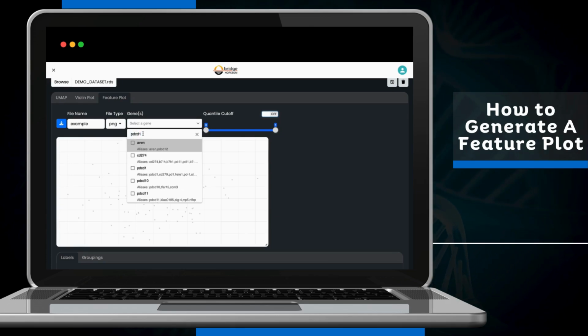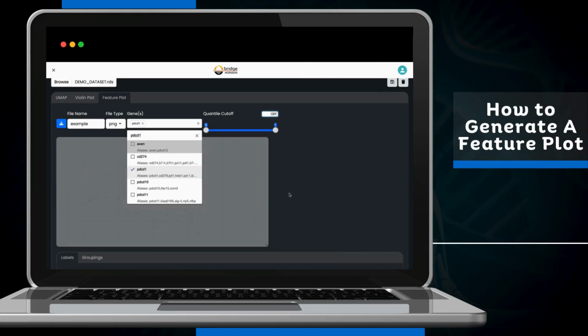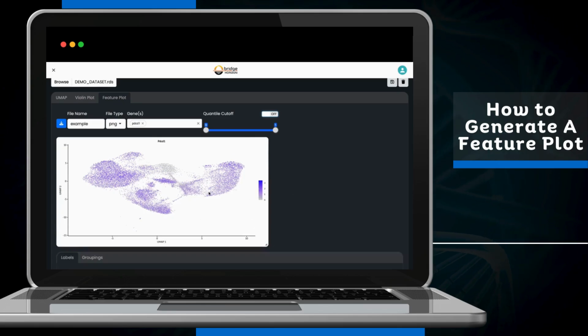So I'm going to enter PDCD1 and then it will populate the drop-down menu with potential matches. At this point, you can select your gene of interest. So I'm going to click on PDCD1, which will then generate a feature plot.